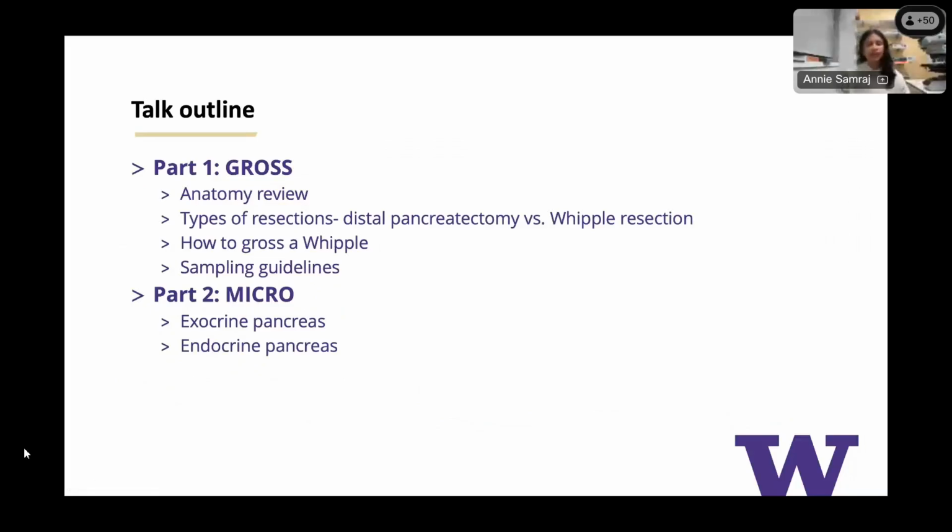So today we'll be talking about one of my favorite organs, the pancreas, and I want to thank the organizers of this remote teaching program for inviting me to talk about the pancreas. For the first part, we'll review the anatomy, talk about the different types of resections, and really the meat of the talk is going to be on how to gross a Whipple resection.